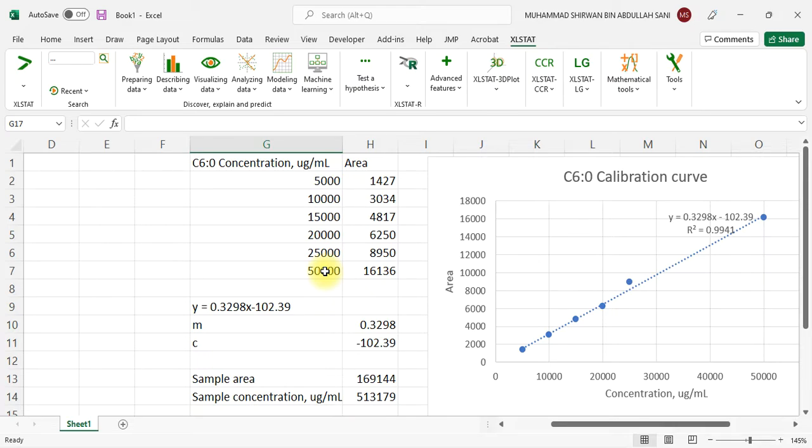But I'm not belittling other software. Other software also have advantages and some disadvantages. But when I use this Excel stat, I know what happens behind it, so that's why I propose to use this one in this workshop. And at least if any result appears, I can explain it to all of you. With other software I'm not familiar, so perhaps I cannot properly explain if there are wrong answers. So that's why I prefer to use this kind of software.